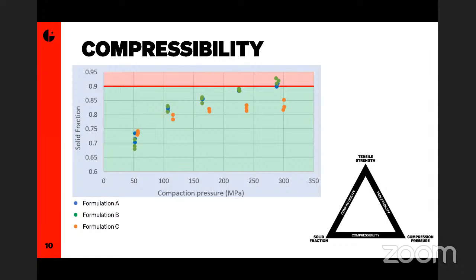The one exception I would say when it comes to comparing the same materials from different sources, where solid fraction does become useful, was an incident where I was comparing samples of a material from 2 different supplier sites, and I saw a significant difference in solid fraction, and it turned out that one supplier was providing us with a different solid state form than the other. That's the only time you should see a significant difference between materials that are the same, if there's actual difference in solid state form. Otherwise, it only indicates a difference in composition.